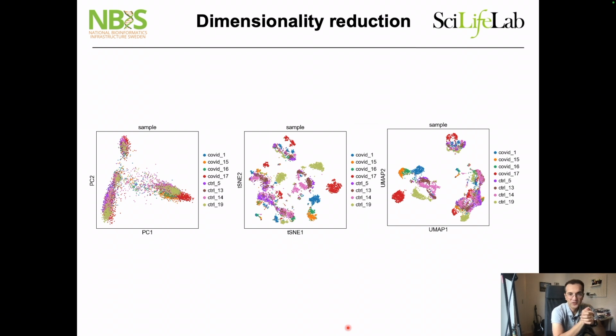Some of you have worked with single-cell RNA-seq data. What's your thought when you look at this UMAP, for example? Is there any problem with it, or does it look fantastic? Harmonization, clustering. So if I rephrase these, COVID-17 is a separate cluster. It's bad. So that's an interesting observation, which you will see in your practical as well.